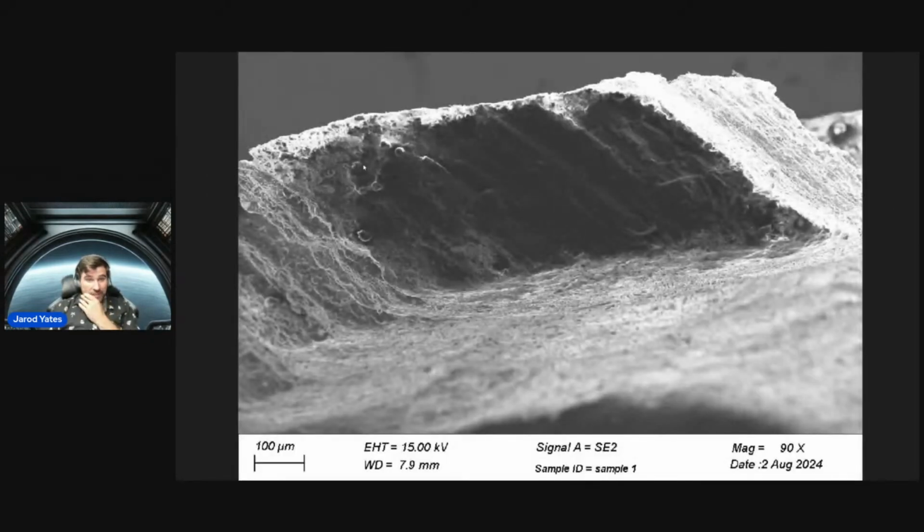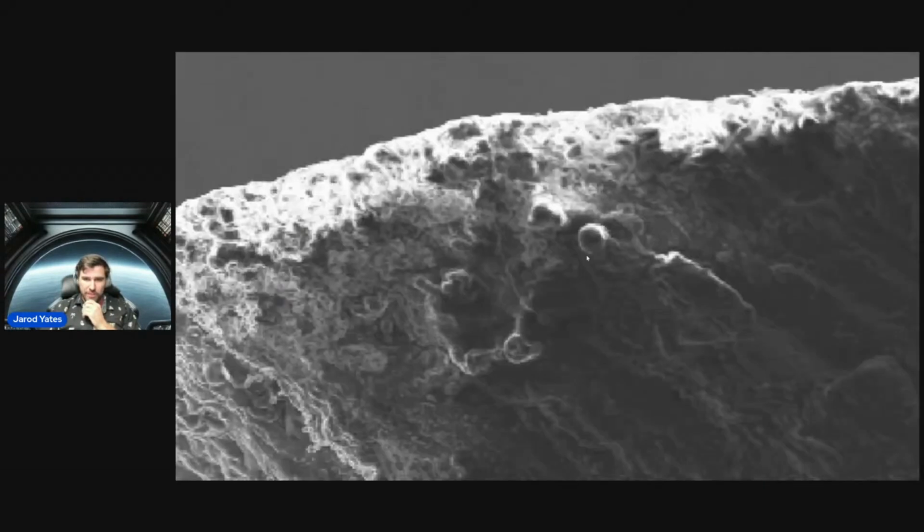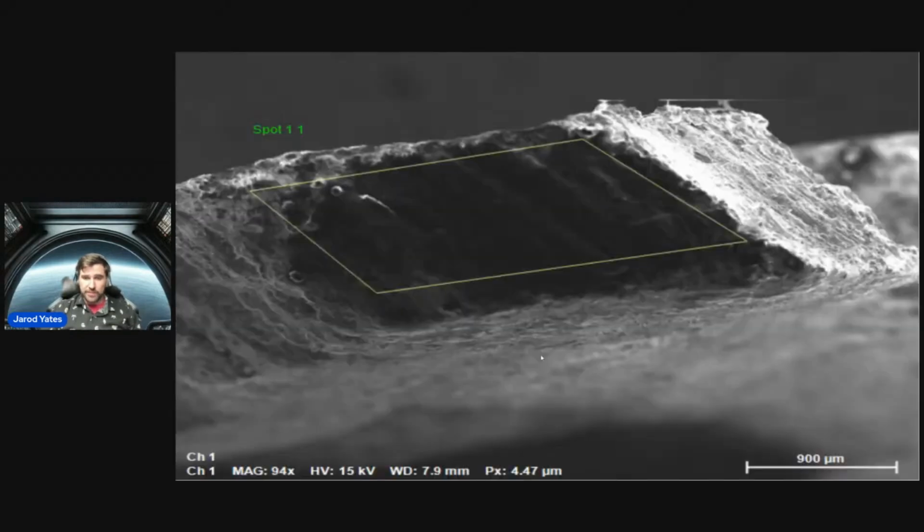So as we're zoomed in here, this area really caught my attention. You can see some of the layering going on here. You can see the striation of the columnar breaking here. But this area here, this really caught my attention. These things look kind of like little nano cylinders, and it looks like there's some connective something going on between them. I'm going to present a little bit later in this talk what I think is going on with these. First, though, let's do some elemental detection of this area.